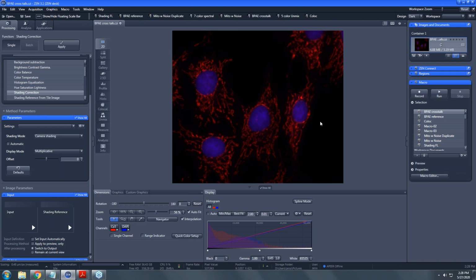But let's take a look at if we have crosstalk. So what does this look like? Actually, the nicest way to see if we have crosstalk initially, because it's not always obvious just by toggling the samples, is to look at the colocalization plot, believe it or not. That's why we did colocalization before we did this.